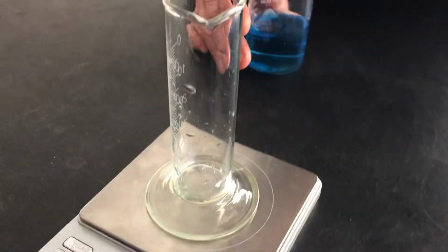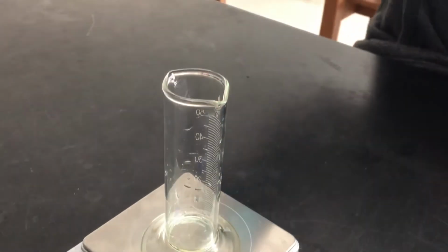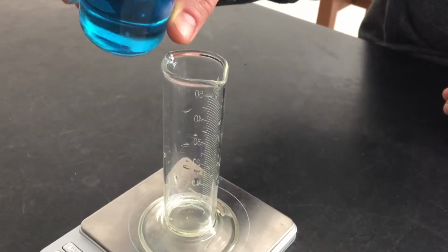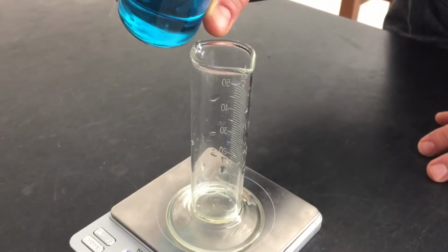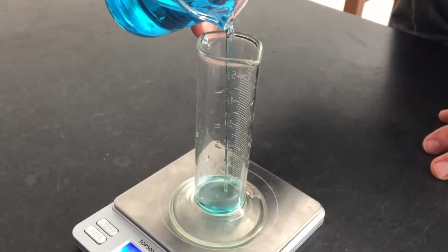Okay, so I'm just going to spin this around so I can read it. I'm going to be putting in this blue sugar water, and I want several measurements from approximately 10 milliliters up to approximately 50. It doesn't have to be exact. So we've done this before, so you should know how to go about doing it.